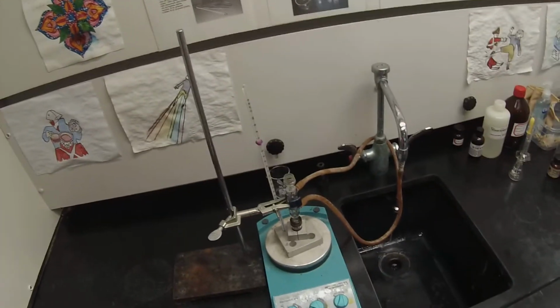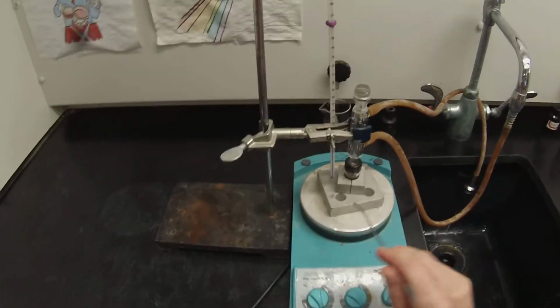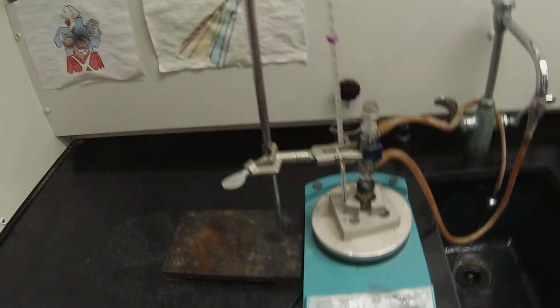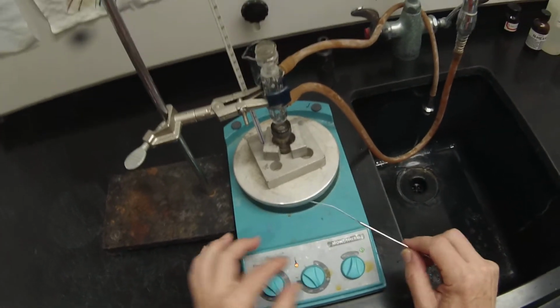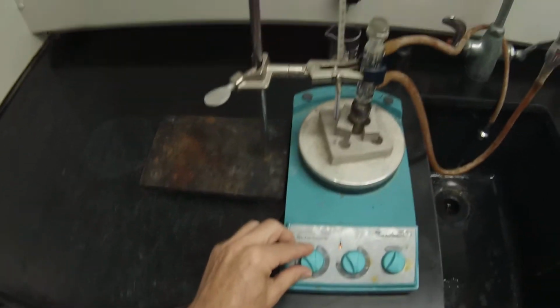So that's really all there is to the setup of this reaction. And it's just going to need to reflux for 90 minutes. Once it starts the reflux process, we'll set our timer. Take a look at the clock. I'm going to pull those out so I can actually see it when it starts boiling. And it's okay to crank this up, maybe to 200 or 225 just to let it heat quickly, and then we'll turn it back down.